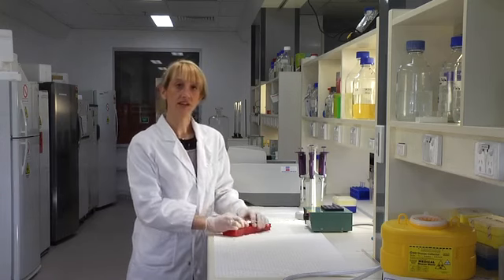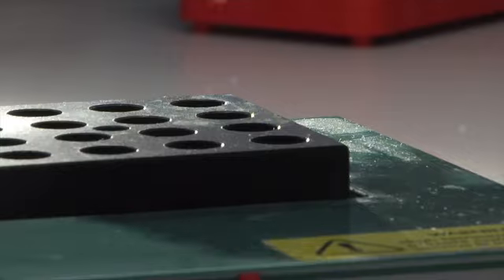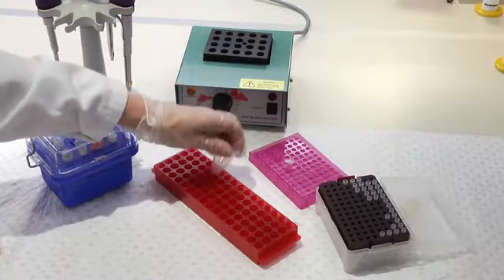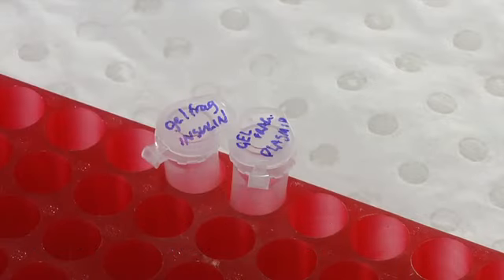Now we've cut our fragments out of the gel, we just need to melt the pieces. Now that they've melted, we just need to mix the digested plasmid and insert together.